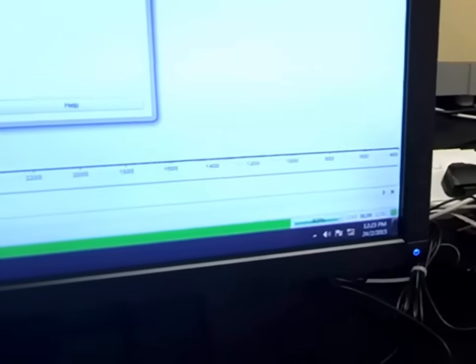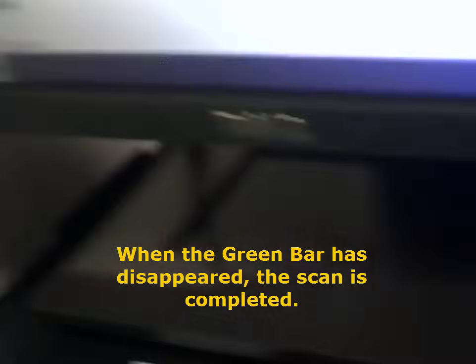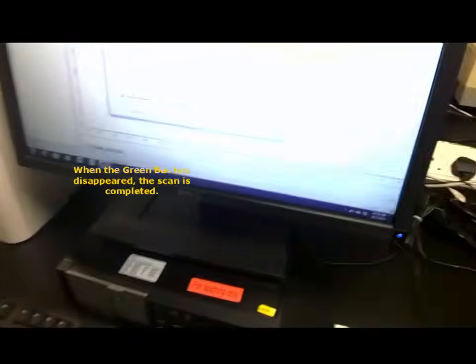So you see, it's going up — 4 scans. And this green bar here shows that it is still scanning. It's 50% getting higher. And after a while, you see the green bar is gone. Done. That means the background scan is all done.